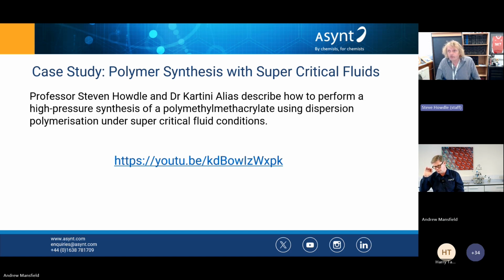So Andrew went through a lot of the safety implications that you need to mention, and we've done that, and you'll see some of that mentioned in the video you're going to see. The only other thing I would add is that if you're working with CO2, you need to make sure you're in a very well ventilated room, because if you release all the pressure that's inside the autoclave into a room that's closed, you might build up sufficient CO2 that you asphyxiate any living people inside that lab.